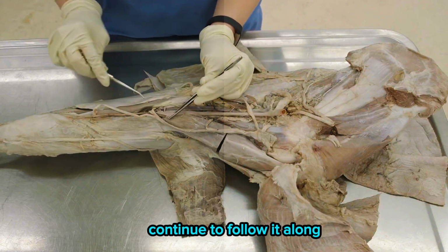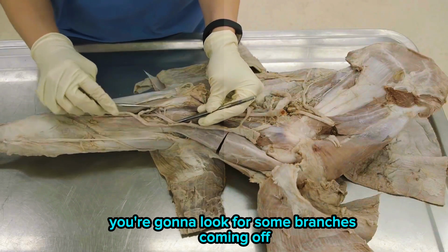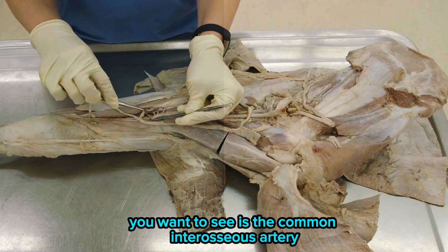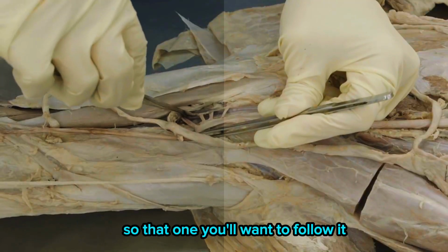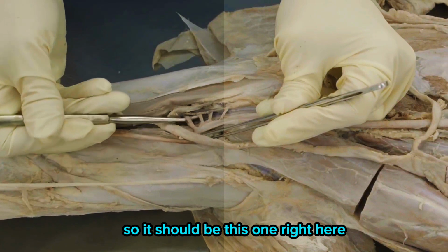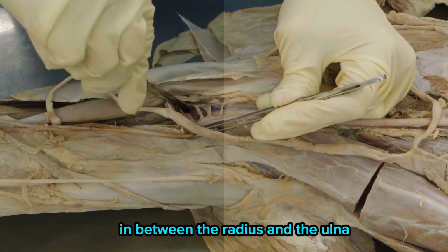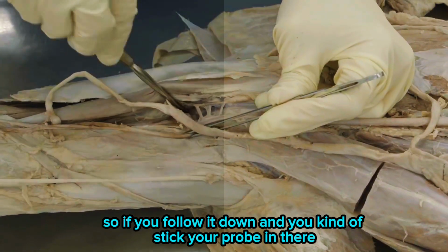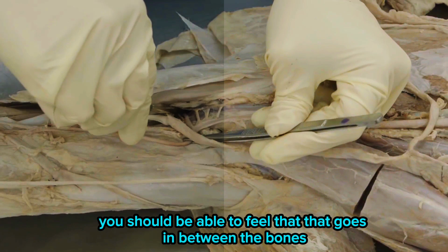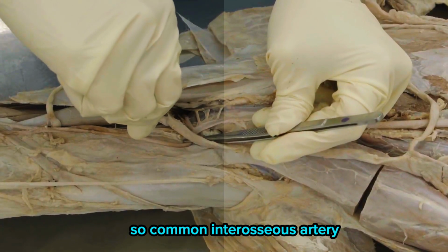Continue to follow it along, and as you come down, you're going to look for some branches coming off, but the one in particular you want to see is the common interosseous artery. You'll want to follow it. It should be a fairly big branch, so it should be this one right here. And that will actually go into the interosseous space in between the radius and the ulna. If you follow it down and stick your probe in there, you should be able to feel that it goes in between the bones. So there should be bone on either side of the probe there. So common interosseous artery.